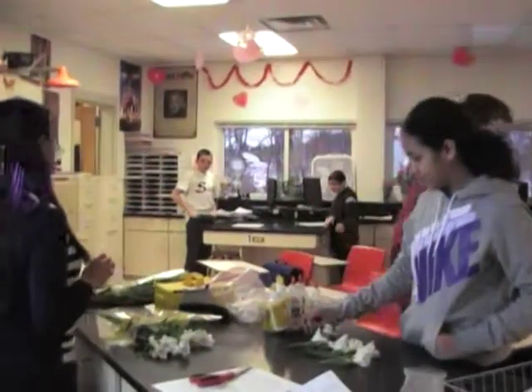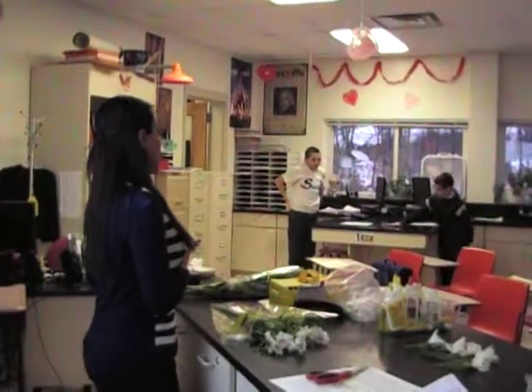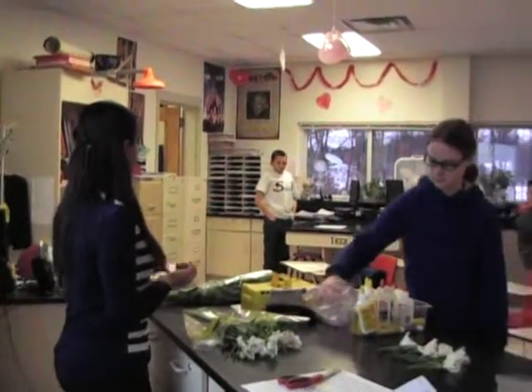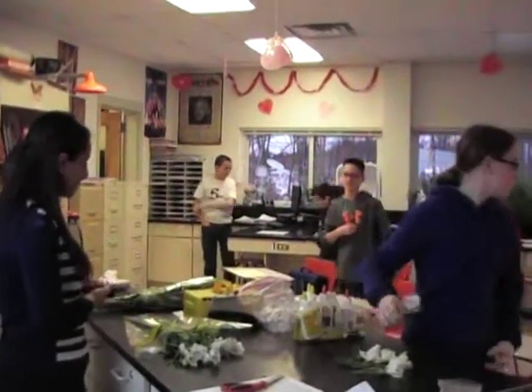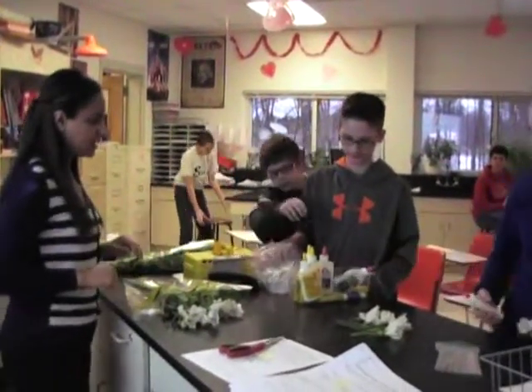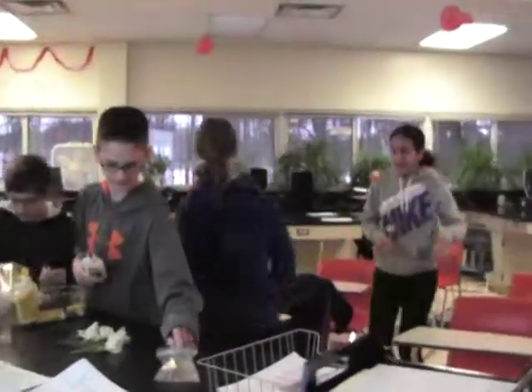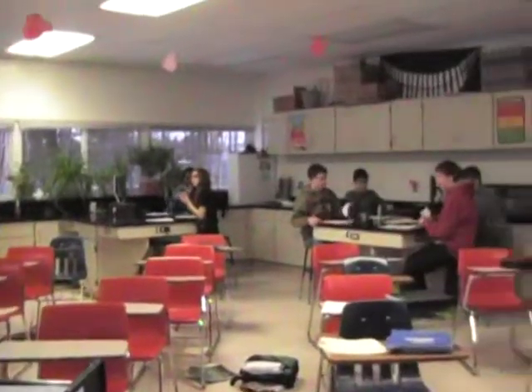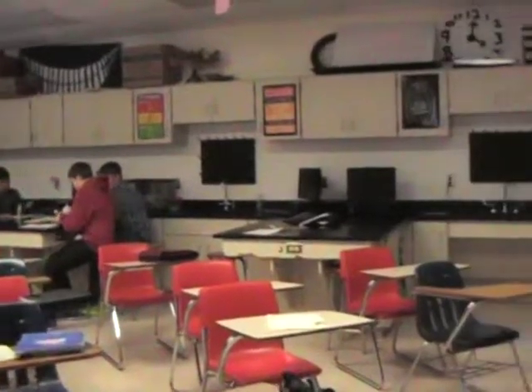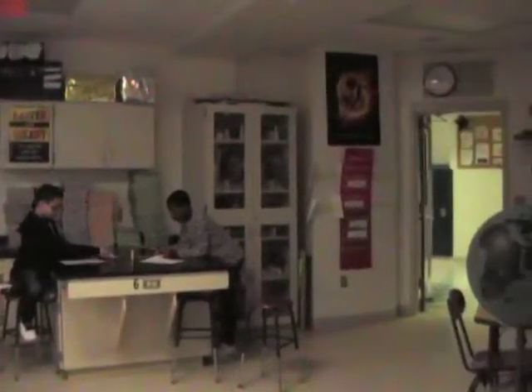Ashley and Sarah. Just one of you. Abraham and Nicholas, one of you, and Josh or Aiden come up. Just take these flowers for now and we'll have time to look at these things. Magnifying glass, forceps. Remember, you and your partner must read the directions carefully and the procedure as you go. I will come around to assist.